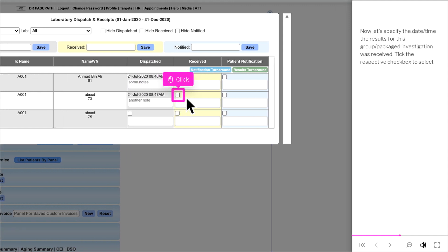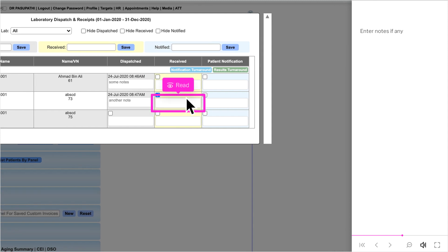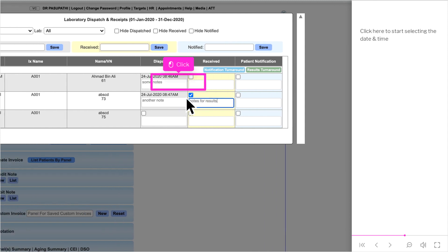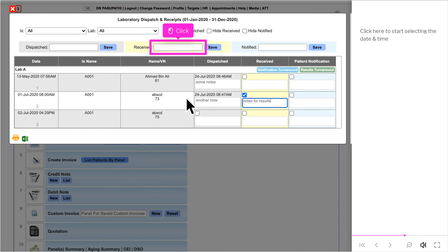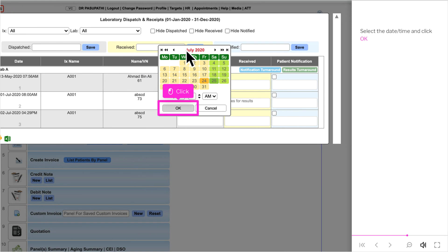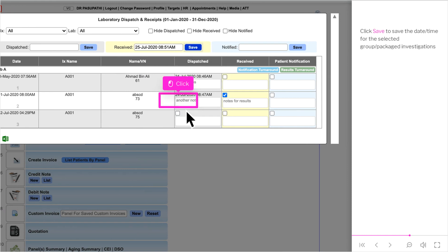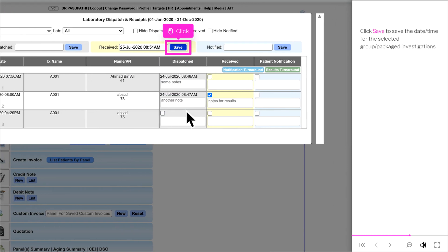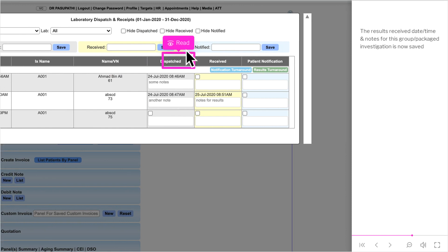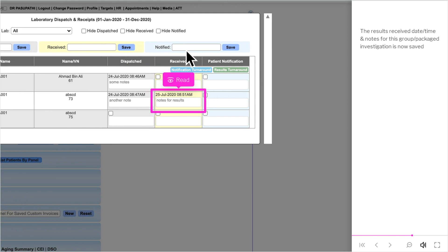Now let's specify the date and time the results for this group or packaged investigation were received. Tick the respective checkbox to select and enter notes if any. Click here to start selecting the date and time, select it, and click OK. Click Save to save. The results received date, time, and notes are now saved.